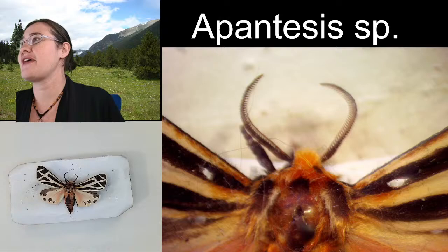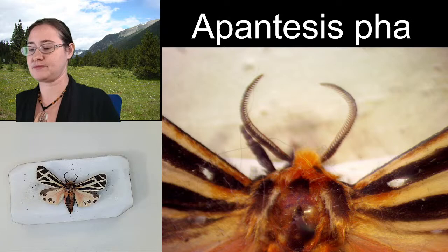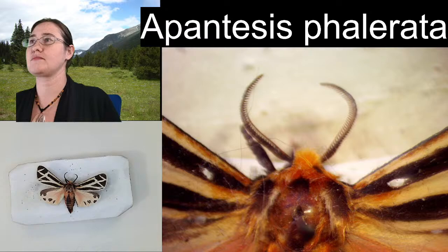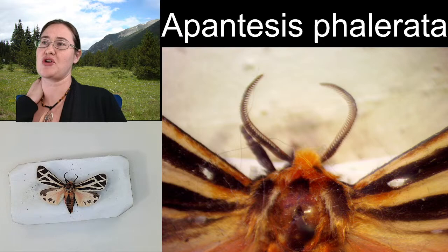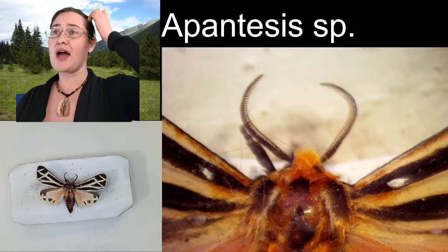Now, I would probably put it at Apantesis phalerata, this one. But so many of the species in Apantesis are so similar that I'm more comfortable saying it this way, because I'm not an expert on these guys. So, we are looking at a tiger moth.